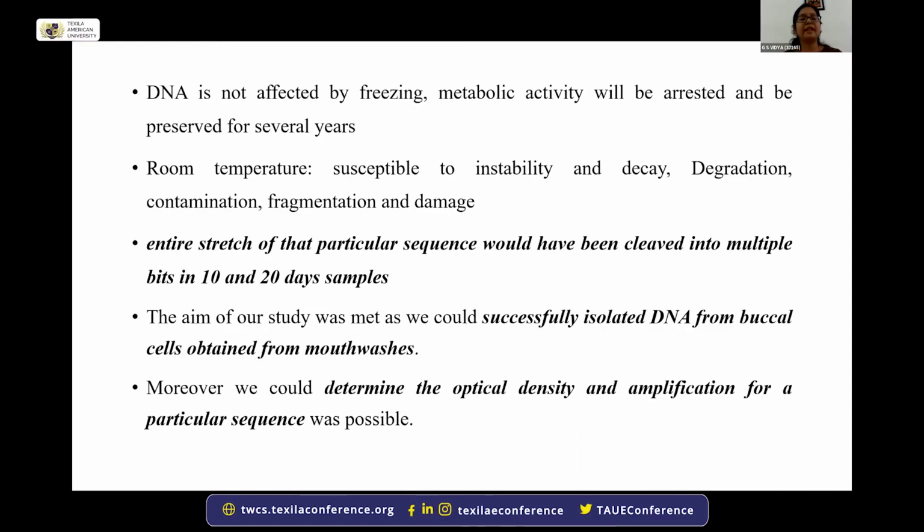We are well aware that by freezing, DNA activity is not going to be affected. Metabolic activity will be arrested, but it will be viable. But whenever we store DNA at room temperature, because of susceptibility to instability, decay, degradation, contamination, fragmentation, damage, all these are going to happen. Therefore, the yield of DNA may not be that good at room temperature. So this could be the reason why the 10 and 20-day samples could not provide amplification, though the extraction was successful. The entire stretch of the particular sequence that we wanted to amplify here was the PAX9 gene. So that sequence could have been cleaved into bits, and therefore amplification was not possible in the 10 and 20-day samples, though the extraction was successful.